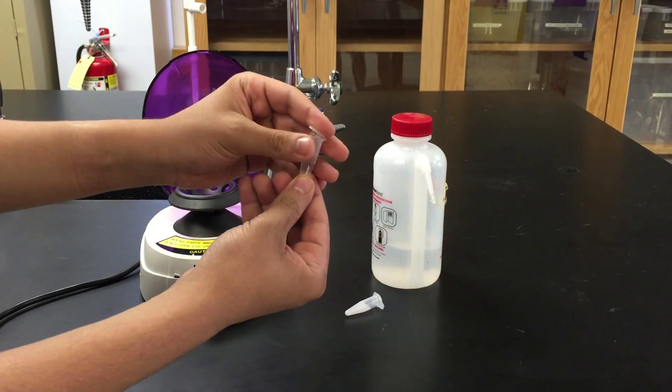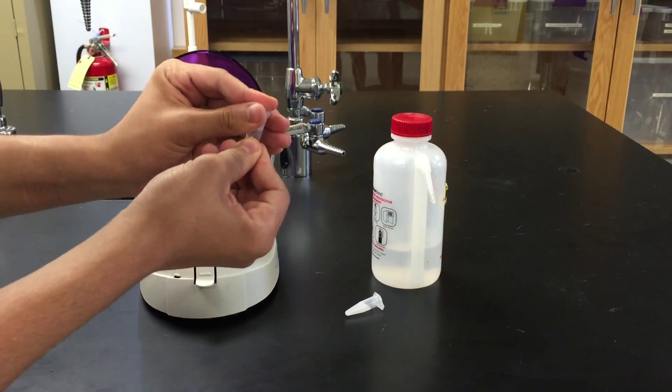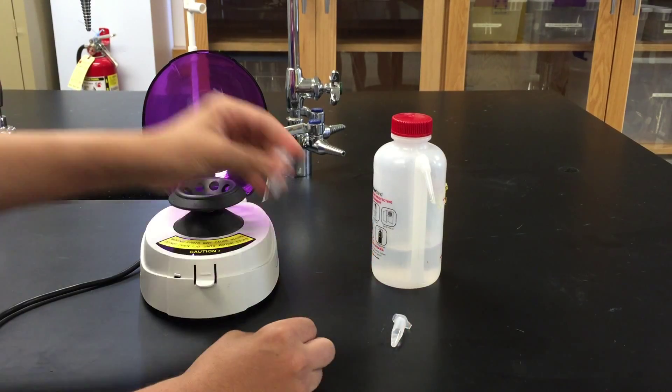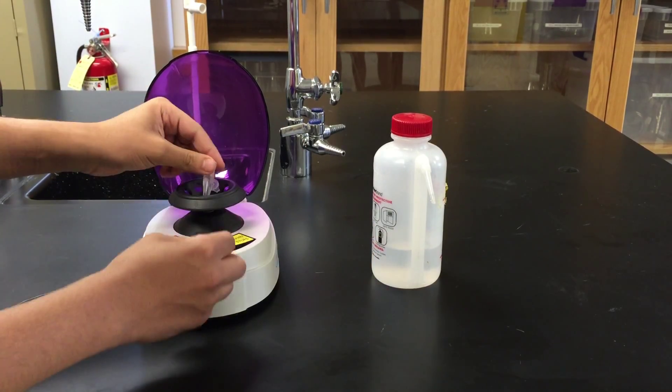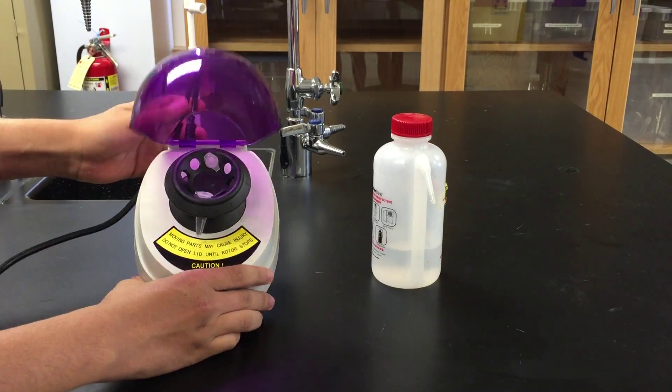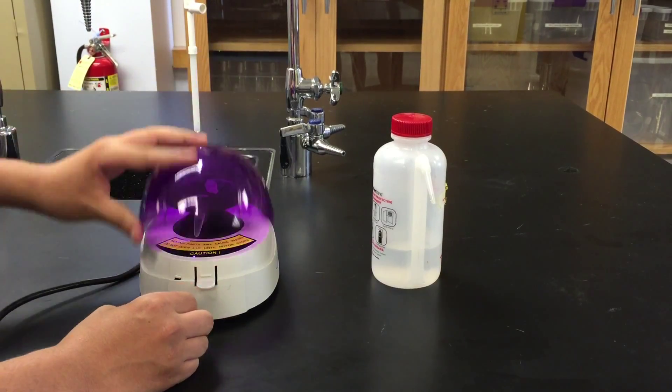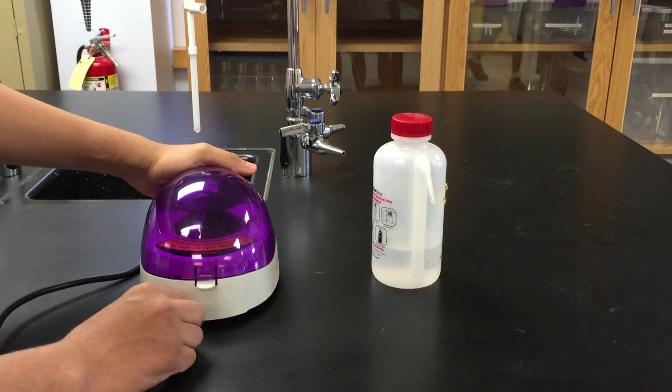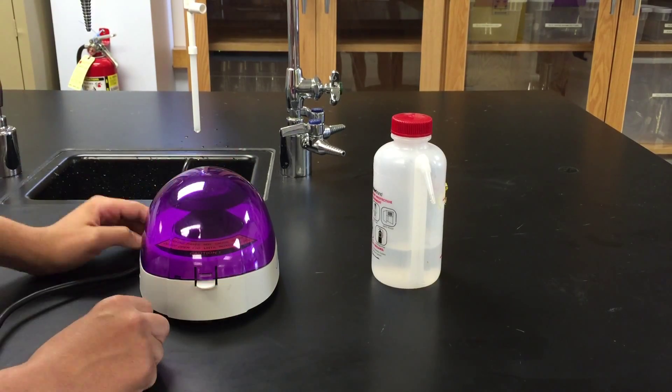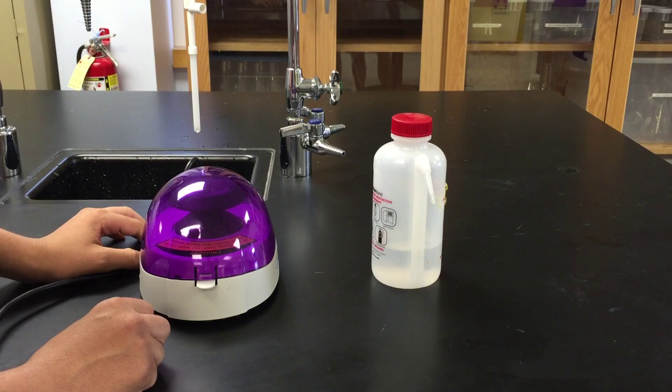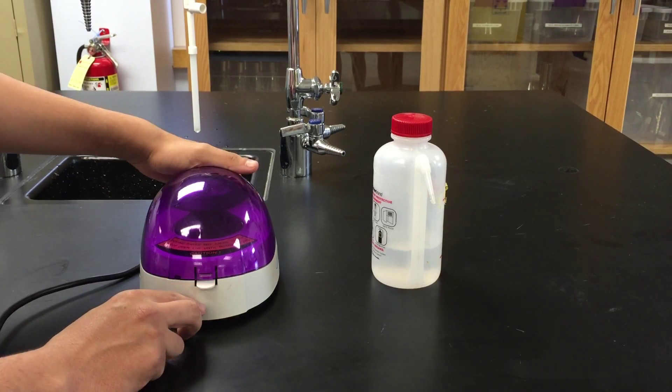And when you place the tubes in the centrifuge machine, arrange them symmetrically. So if you have two, place them across from each other as shown. If you have three, you would still place them symmetrically. Now turn on the machine and let it run for a few seconds. If you hear a vibrating sound, that means the centrifuge isn't balanced, and you should quickly turn it off and check to see what the problem is.